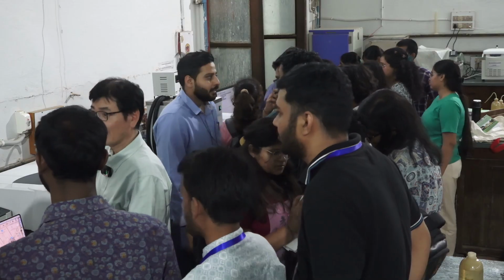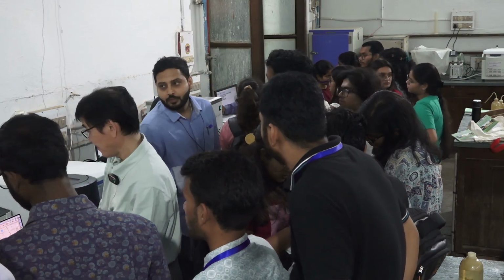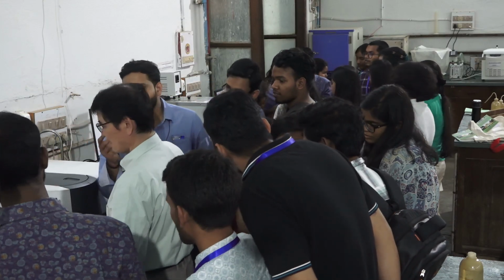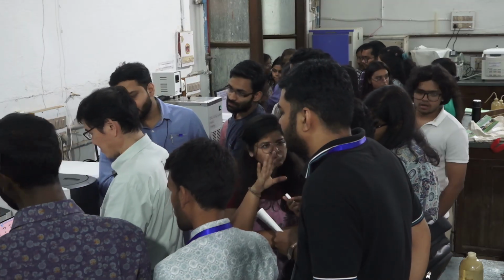ATR-IR, attenuated total reflection. Sir is telling them to do it themselves. So you can do it yourself. Is there someone who wants to operate?